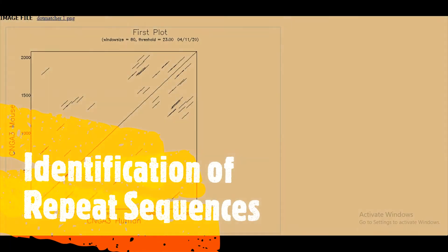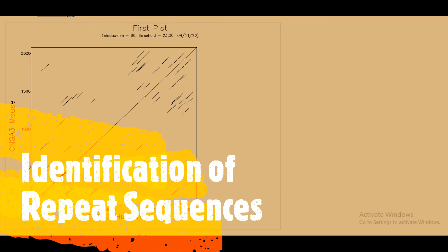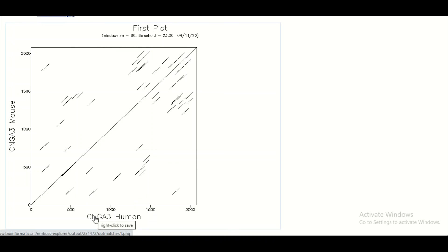This dot matcher graph is particularly very handy when we want to observe repeat sequences. Here on both axes we are going to set the same sequences, and then these sequences will be aligned with one another, and we will observe the repeat sequences if they are present in our sequence.